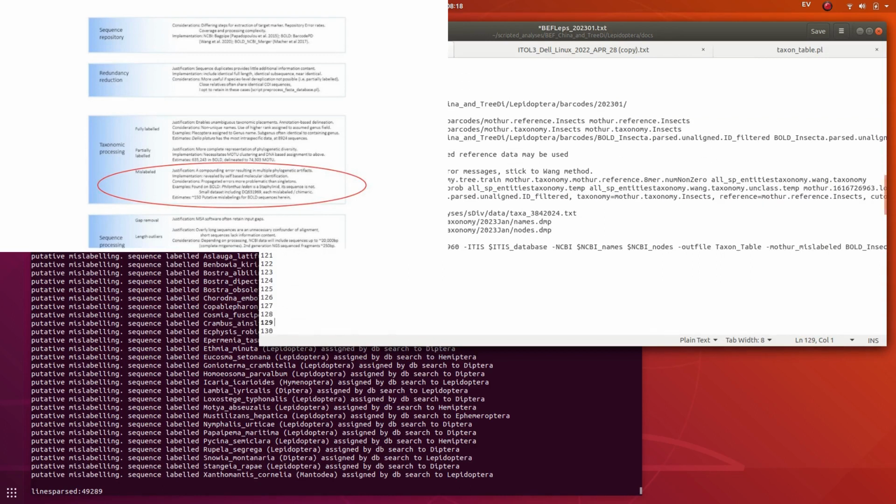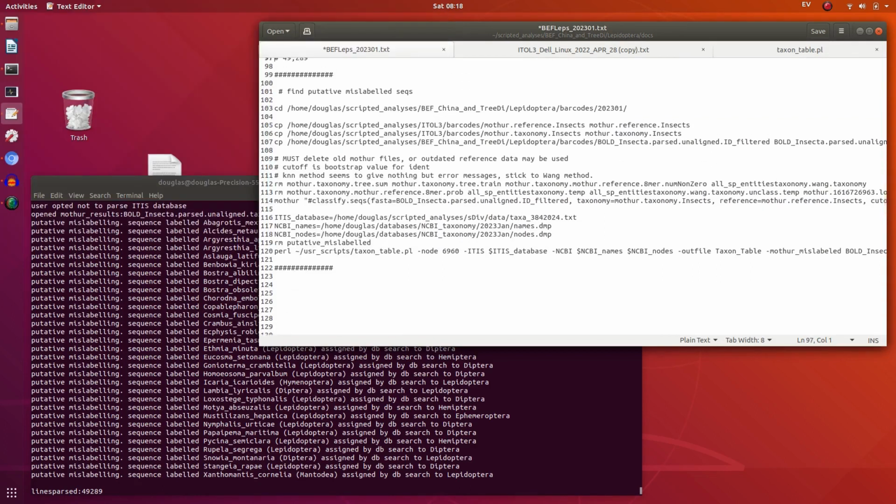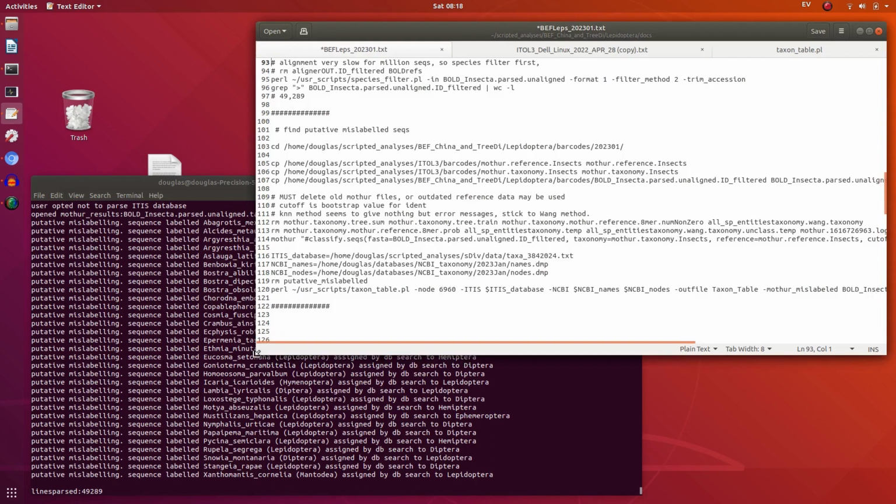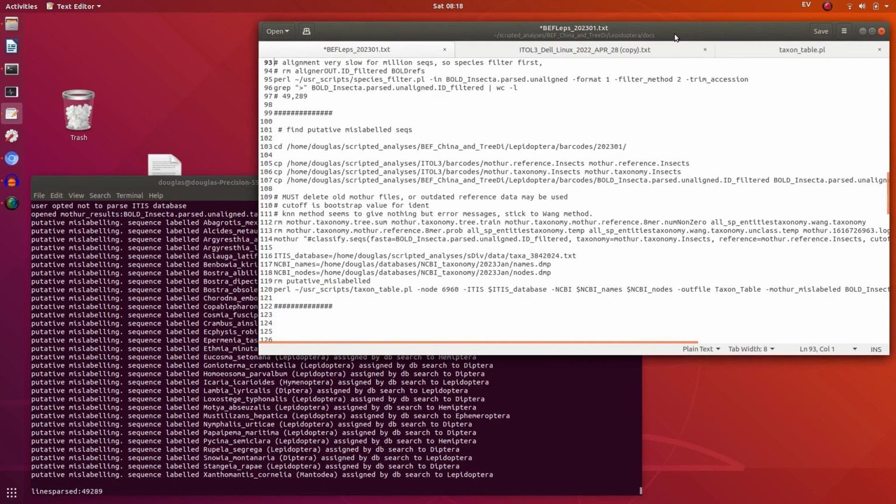Now, I added this module in my third major iteration of the insect phylogeny, and when you run this on BOLD, there's really remarkably few mislabeled sequences in there. For all of insects, out of well over 1 million sequences, I think there's about 150, which is a very low error rate. But still, it's good to identify and remove these if possible, because they can cause propagated issues.